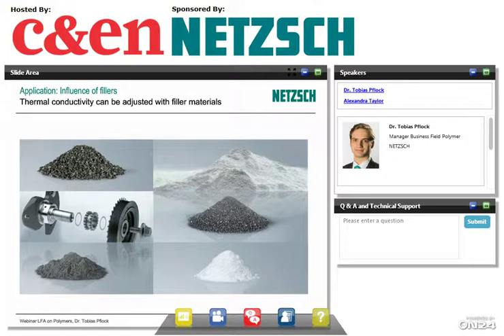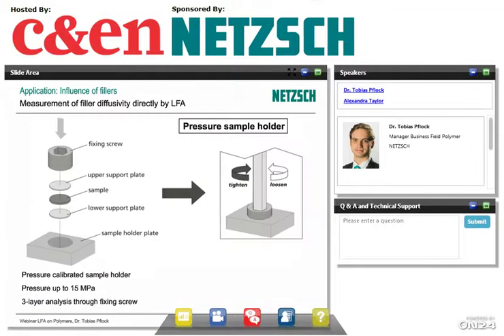Well, if you look at these brake pads, this is quite an interesting example because there's actually quite some different materials that people put into this material, even pieces of metal in order to adjust the thermal conductivity. Of course, also different properties. You could also use chalk to adjust, or chalk has an impact on the thermal conductivity. Carbon black as well, silica materials, and to carefully adjust it, we will see an example of boron nitride, where boron nitride is used, and a second example where we will use carbon nanotubes to adjust the thermal conductivity.